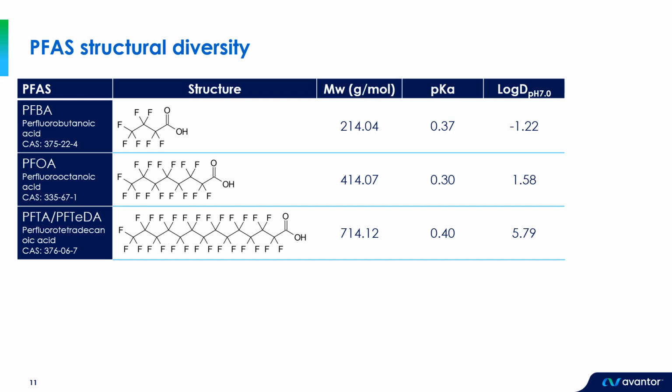Therefore, we require reversed phase liquid chromatography, and we'll need to operate in gradient mode to cover a range of hydrophobicities. One important thing to consider is that the longer chain compounds can be rather sticky, so we need to be careful during sample preparation processes as they'll have a tendency to stick to our sample containers. So when transferring samples between containers, we typically have to wash those original containers with organic solvent in order to quantitatively transfer all of our analytes.